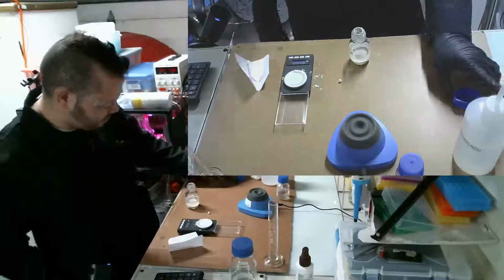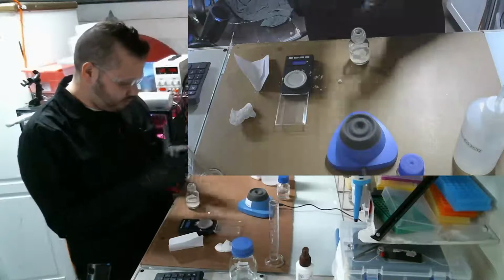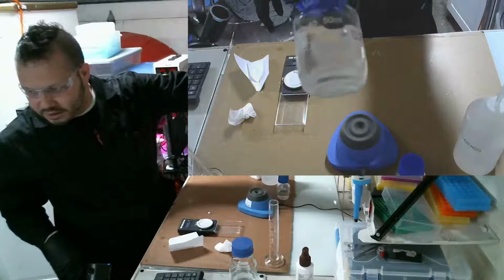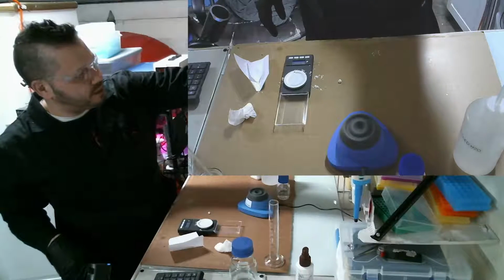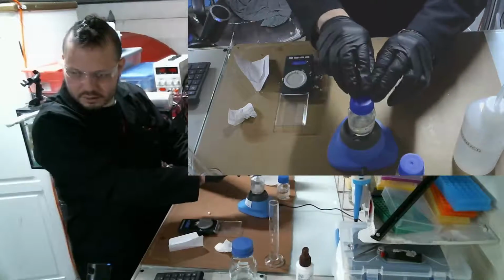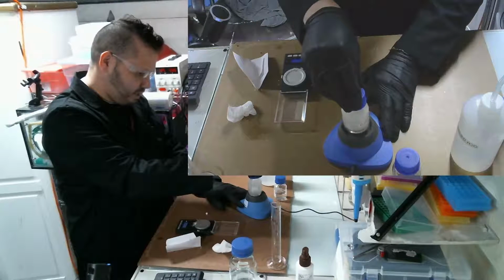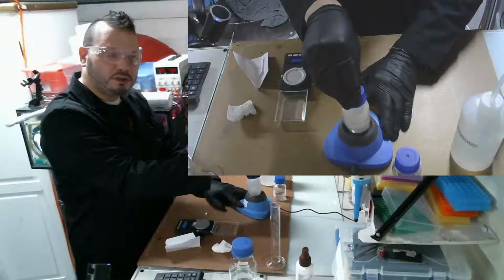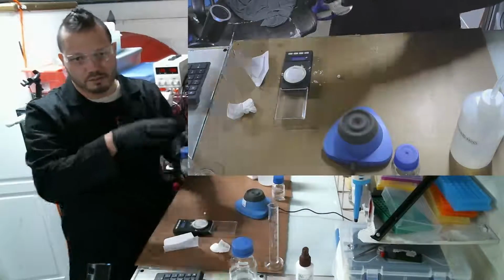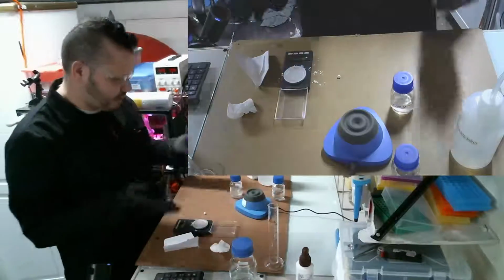Now, this stuff is a lot like indole acetic acid in that it needs to be in a 14 pH environment. Interestingly, this stuff actually sinks to the bottom rather than floating to the top. Now I'm going to use the vortex mixer. What I'm waiting for is my algae culture to get to 30 million, so that I can separate them into 3 batches of 10 million. That'll be the baseline start, and then I'll grow them from there.